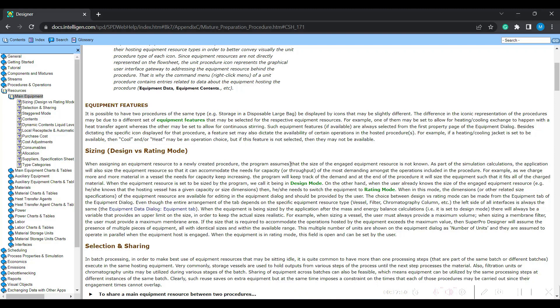But in case of a fed-batch system, you charge some quantity of media and continuously feed other quantities into the system. Only at the end of the process can you understand how much reactor volume is required. Basically, design mode indicates that the software will try to estimate the size of the equipment required to carry out the process.